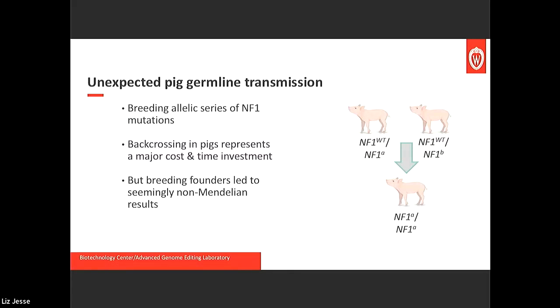I'm going to go way back to 2017, 2018, something like that. It's been a little while, but this is a good use case for when we first figured out that the gold standard in the field generally is PCR your target and sequence it, right? But if I cut to the chase here, sometimes that's not enough. So I'm going to give you a little story of how we came to that point. And this is even before compartment-based digital PCR instruments were available, so we were using the BioRad at the time.